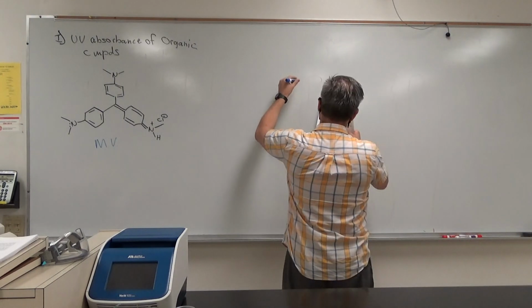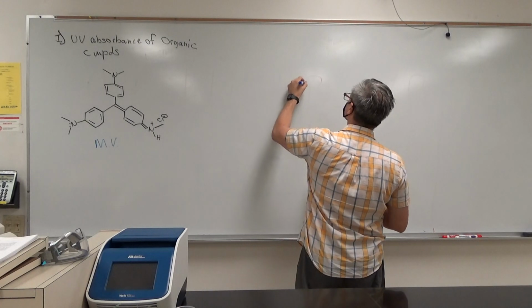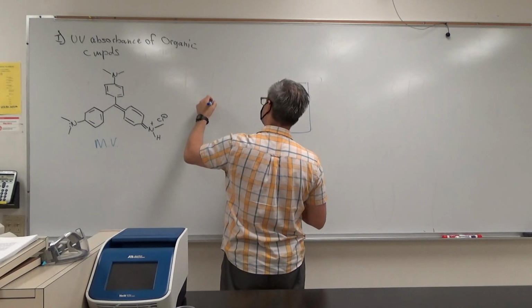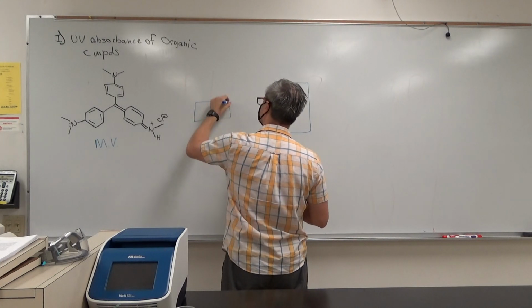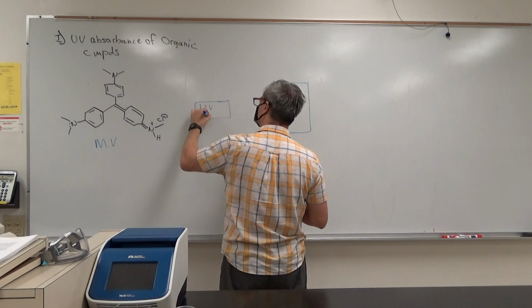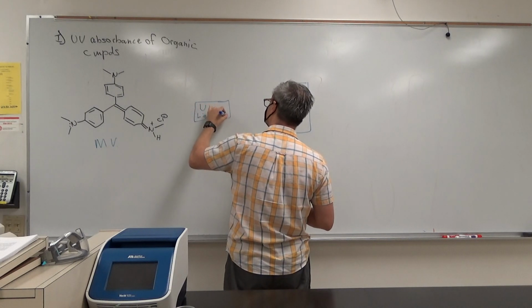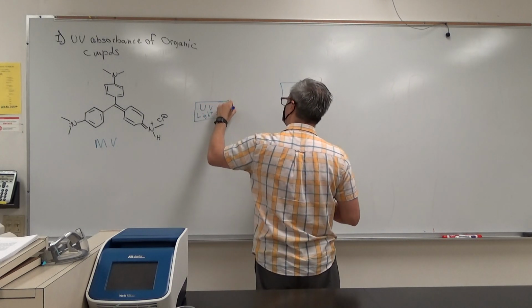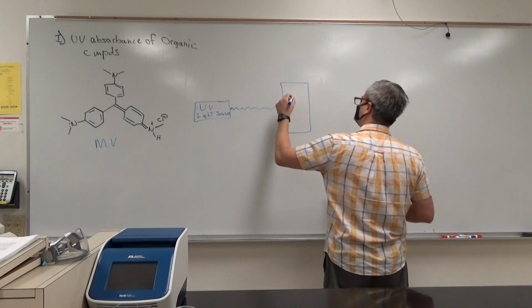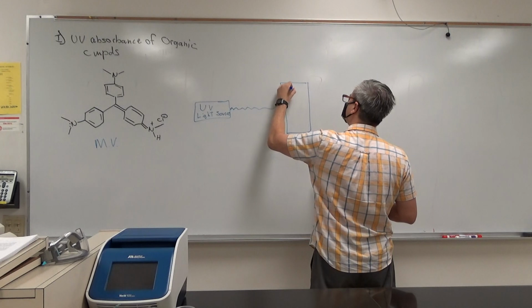Okay, so we got our light source again. UV light source. Okay. And here's our sample compartment.